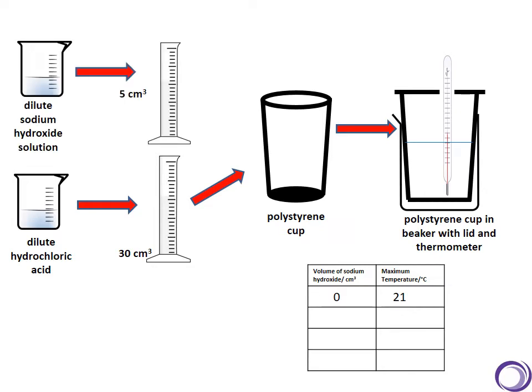I'm then going to measure out five centimeters cubed of sodium hydroxide, and we're going to add that to the beaker. And we're going to watch the temperature increase until it's reached its maximum temperature—that means it's not going to go up anymore. Then I'm going to record that result in my table.